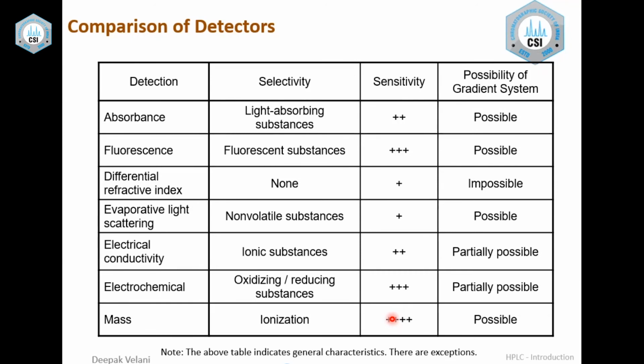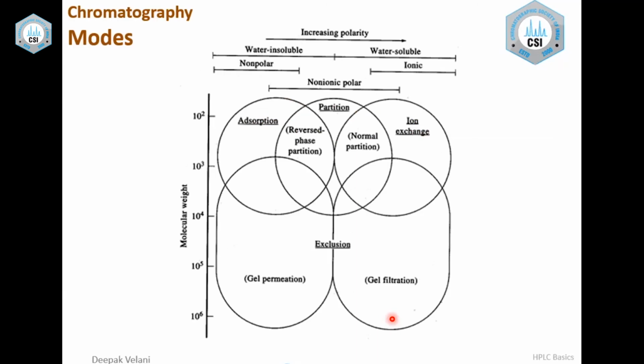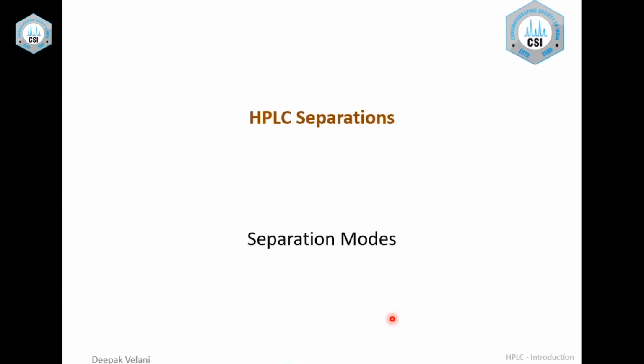But nowadays, because of specificity requirements, very small mass spectrometers have been innovated, and people have started using them in quality control environments also. So this is a brief on the overall hardware system. I am sure I could justify it. This is the change we made from the morning session, in that we have focused on the hardware. And now coming to separation modes. So with HPLC, what kind of modes do we use for the separation?